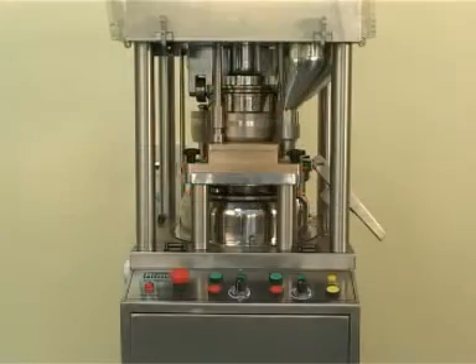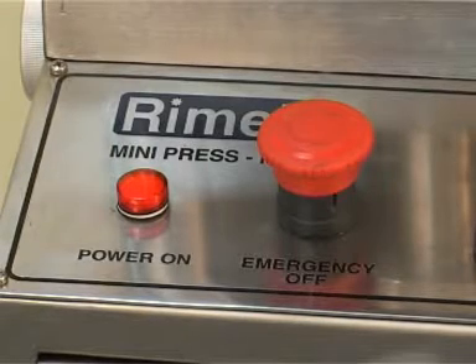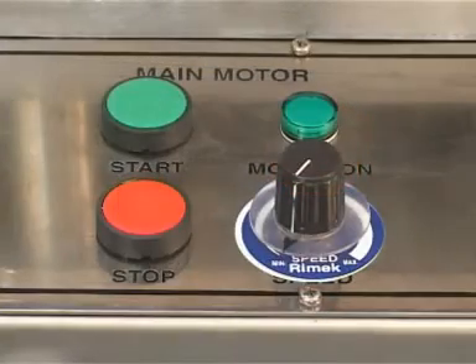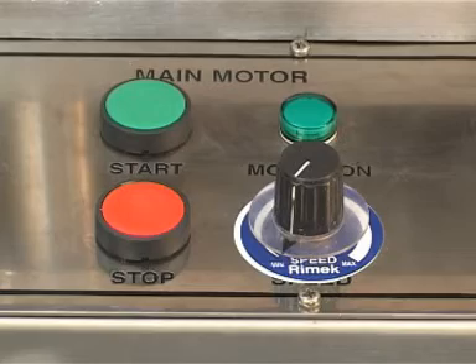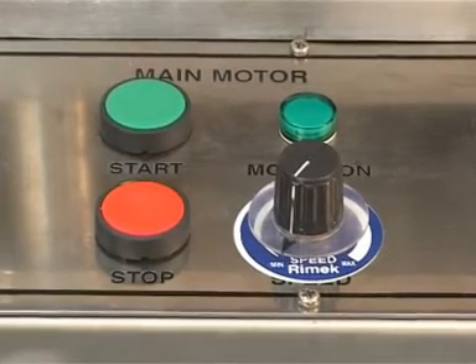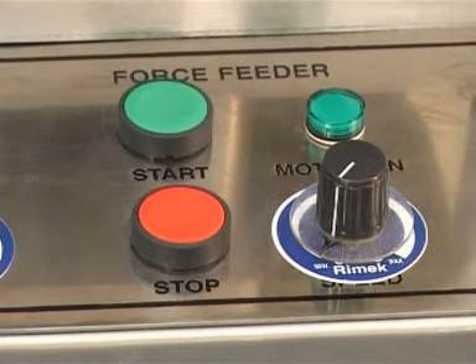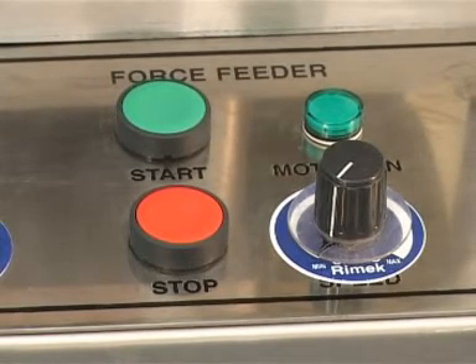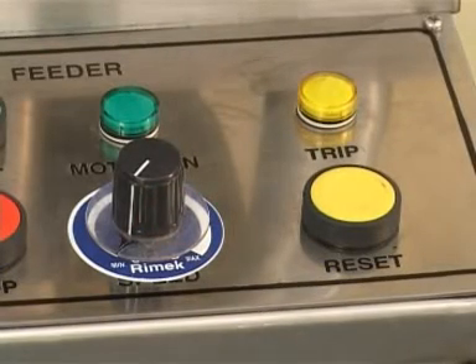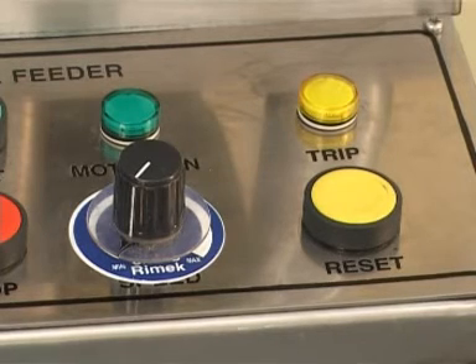Control Panel: It is mounted horizontally on the front panel. It has various machine controls like power on and off indication and an emergency stop push button at the left-hand side of the operator. There is a potentiometer to increase or decrease the speed of the turret. On the right side of the turret control there is a force feeder on (green) and off (red) push button. There is a potentiometer to increase or decrease the speed of the force feeder motor, and at the last there is a yellow light indication to show the tripping off of the machine and a yellow push button to reset the tripping of the machine.